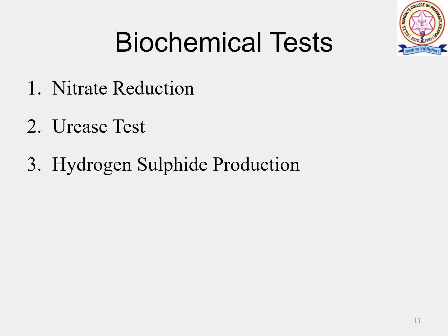Next test is the hydrogen sulfide test. Some organisms are able to decompose sulfur containing amino acids, producing hydrogen sulfide among the products. When cultured in media containing lead acetate, they turn black or brown. Instead of lead acetate, we can use ferric ammonium citrate or ferrous acetate.